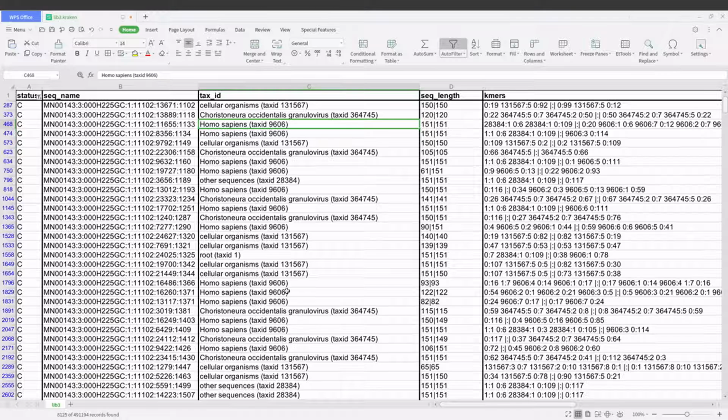Now, with microbiome, you can use that to tell a story. One of the things we can do is to establish the feeding behavior of the mosquitoes. Let's just look at Homo sapiens appearing here. This tells us that the mosquitoes probably, not all of them by the way, some of the mosquitoes probably feed on humans. Because one of the ways that we can get sequences from humans appearing here is if the mosquitoes feed on humans by taking the blood. So that is one of the things we can establish using microbiome.